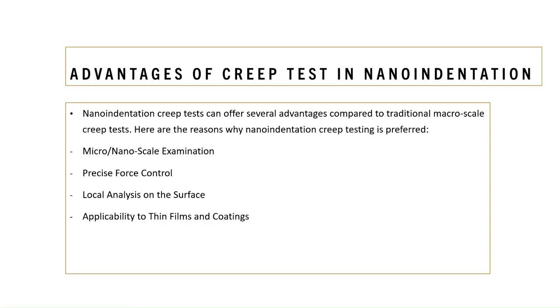And if we were to discuss the difference between nanoindentation and uniaxial creep testing, the first advantage is micro and nanoscale investigation.